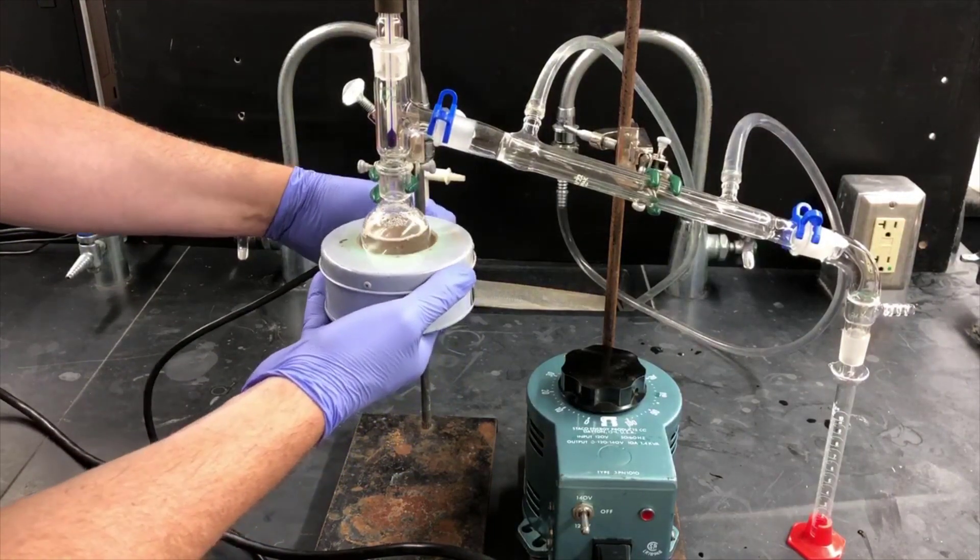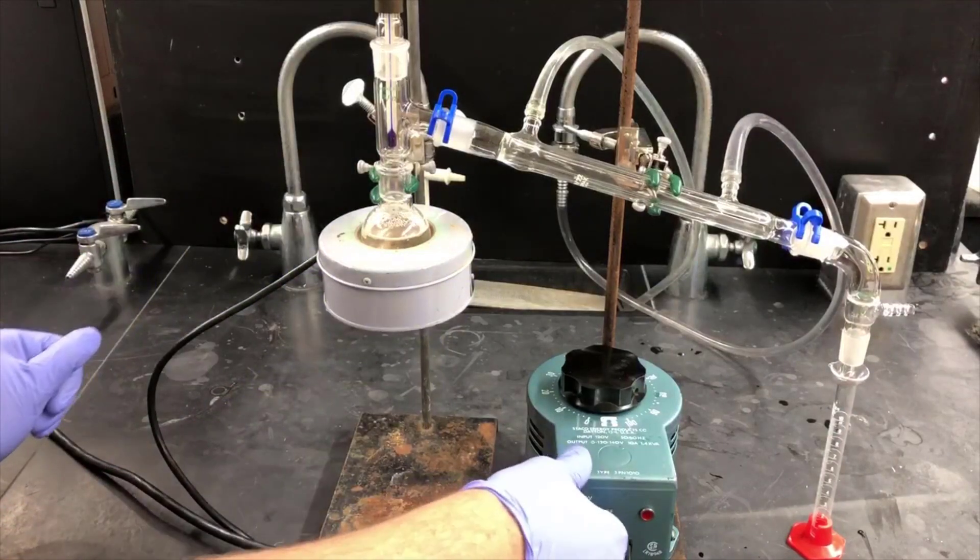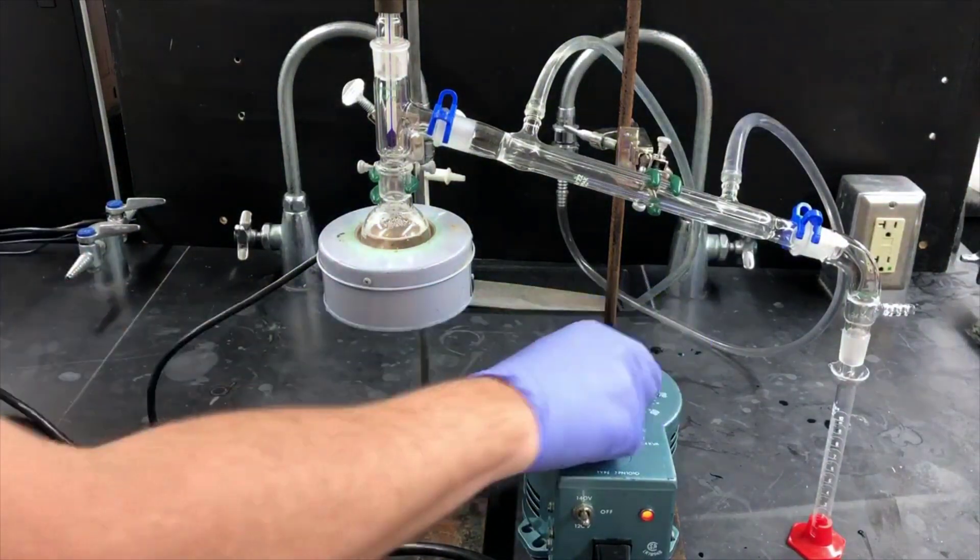Here I'm raising up the heating mantle to make sure it makes good tight contact with the bottom of the flask. I'm turning on the variable transformer and setting it to about 50% power.